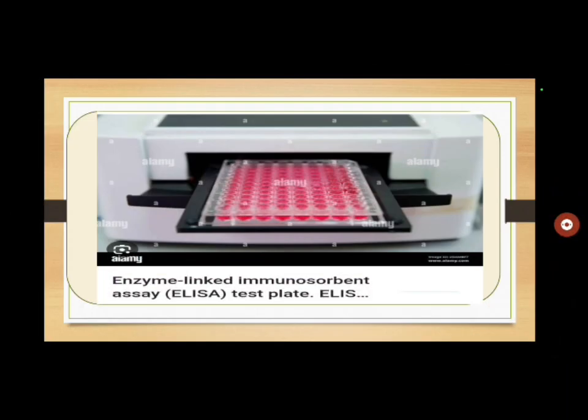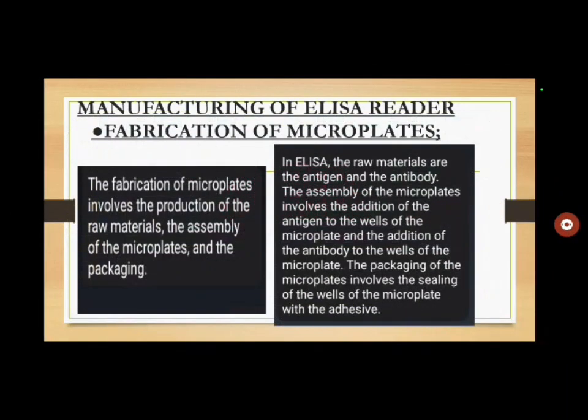Picture of ELISA assay. Now manufacturing of ELISA reader.